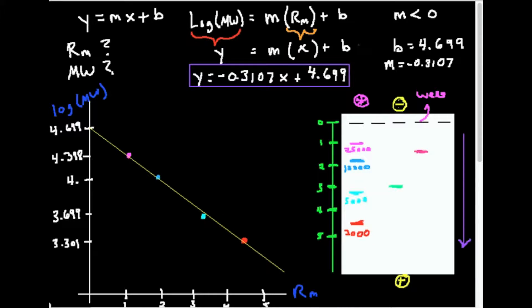What we're going to focus on in this video is how you analyze the gel itself, and we're going to use an example of how you would calculate the molecular weight of an unknown. The two unknowns are unknown one and unknown two. How would you determine the unknowns given a molecular weight ladder?